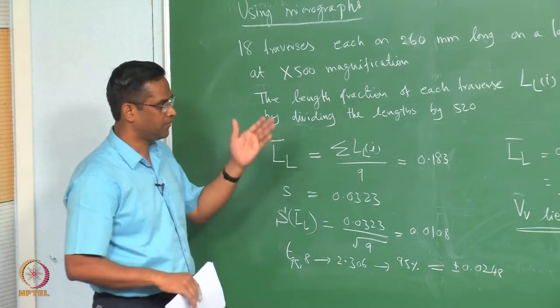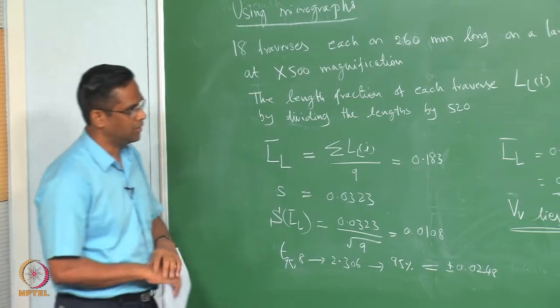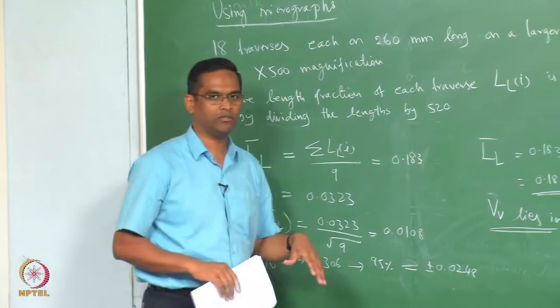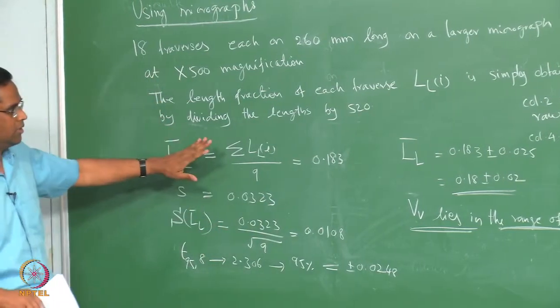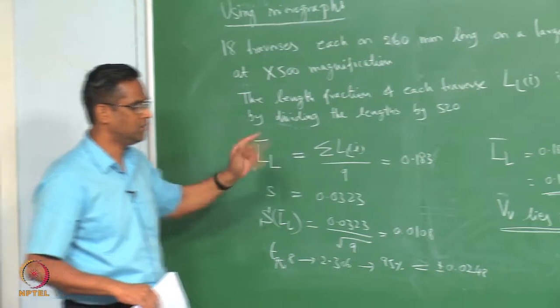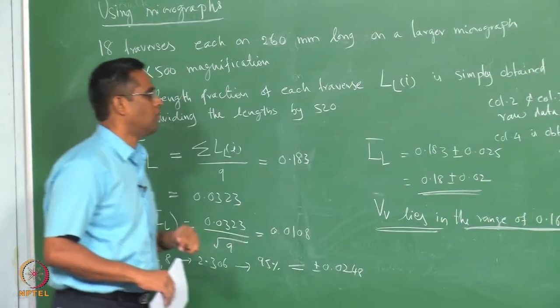You should try this with some readily available micrographs, then you will appreciate the result much better than simply taking it from the software.